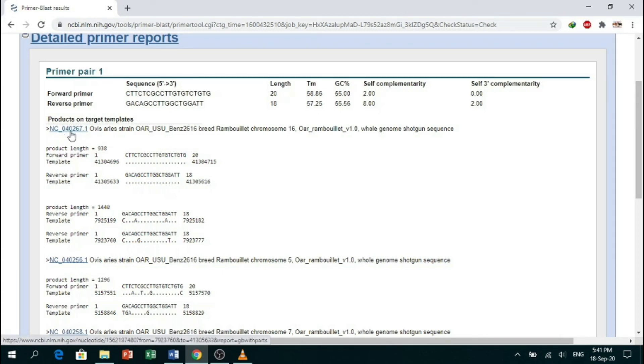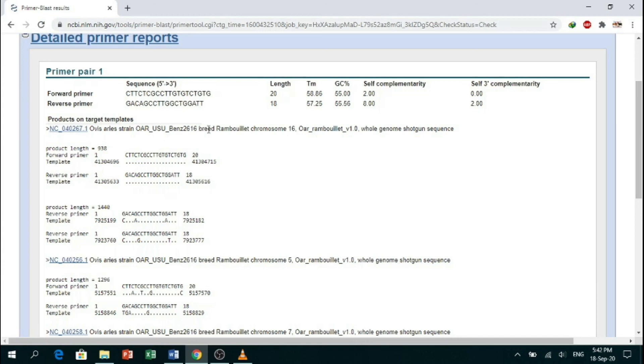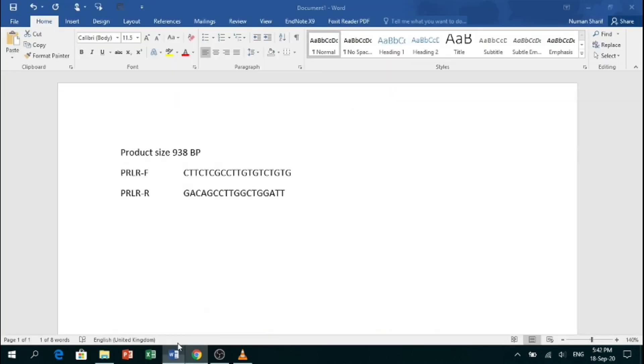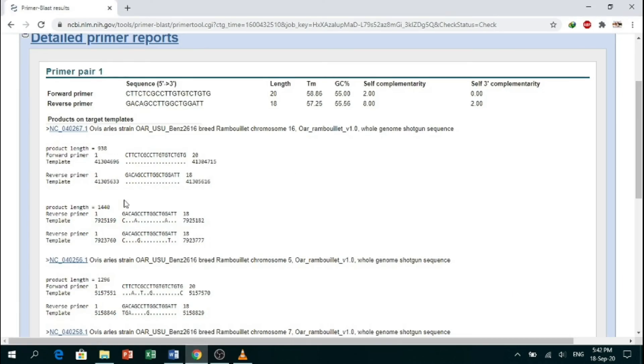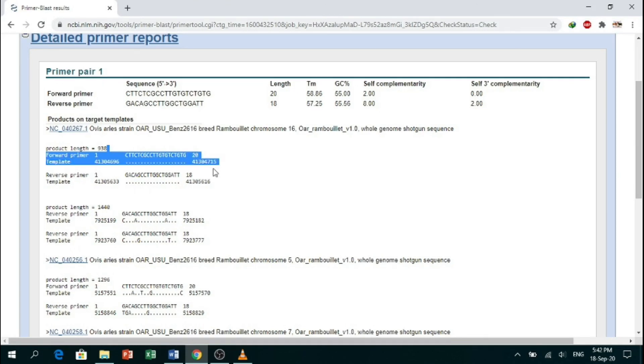Here is the reference assembly of Ovis aries, the organism which we are using. Here is the product length, which is the same as that for which we have designed: 938 base pair. So our primers are specific to that region for which we have designed them.